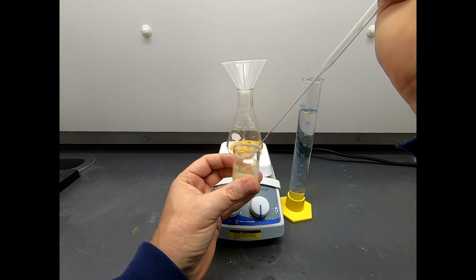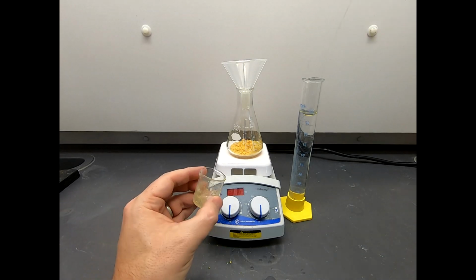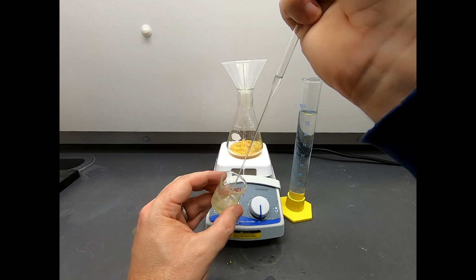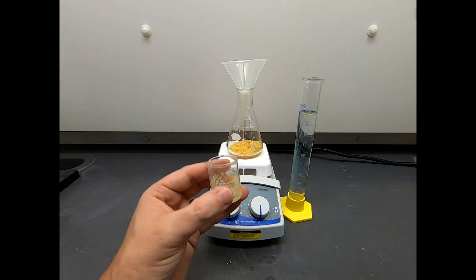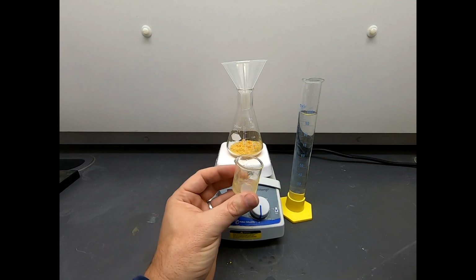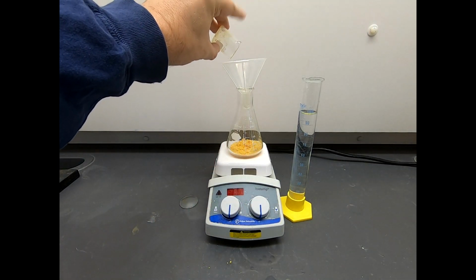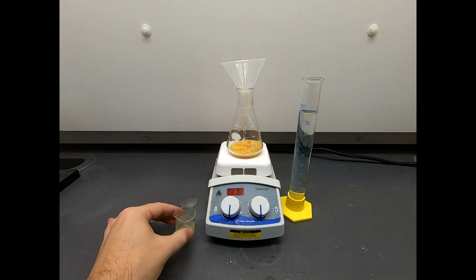I've got a little bit of a pipette problem here. Let me fix that. That pipette bulb is coming off of the pipette. There we go, that's better. But this is just a really dilute acid solution. This is what the procedure calls for. It actually doesn't specify, it just says a dilute acid solution. You can say this material is not very soluble. It is not going to dissolve, which is fine, because there's very minimal loss in that beaker.